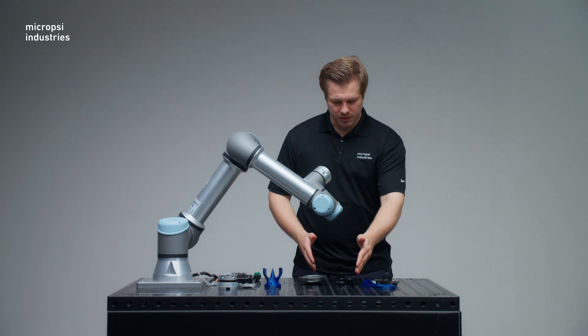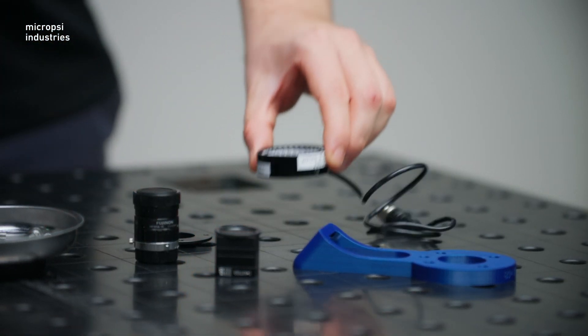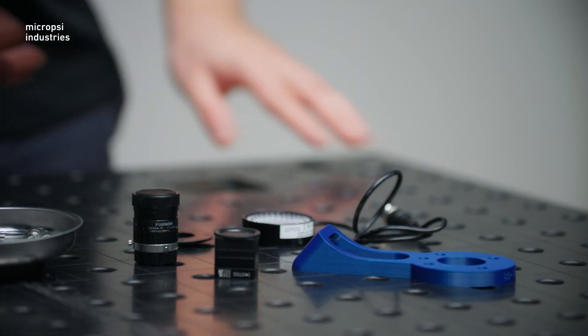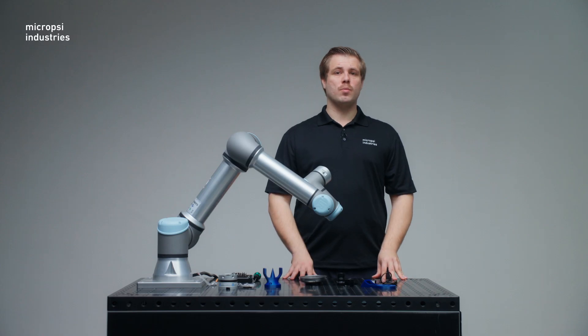Now let's look at the components that are indeed supplied with the mirror kit. First is the camera and the camera lens. We're also supplying a ring light, ring light adapter, and a 3D printed camera holder. We're also supplying all screws that are required to mount your setup.